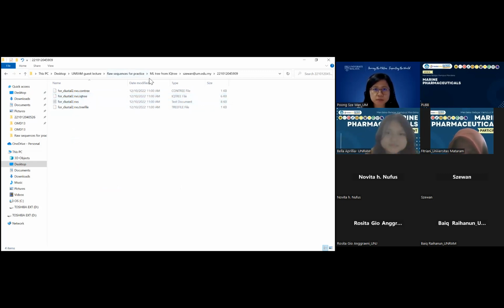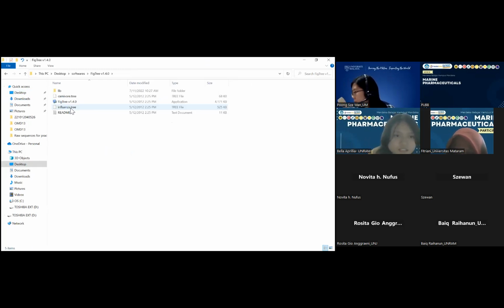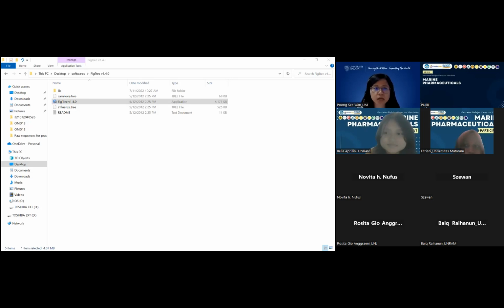Is everyone catching up? Hold on, let me see if there's anything in the chat. Oh no, nothing in the chat. Okay, so now let's open FigTree. I've also asked you to download this. FigTree. Okay, open FigTree. And then click open. Is it moving? Oh, okay. I need to share the screen first. Sorry.